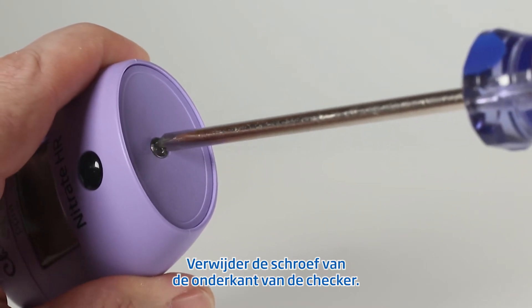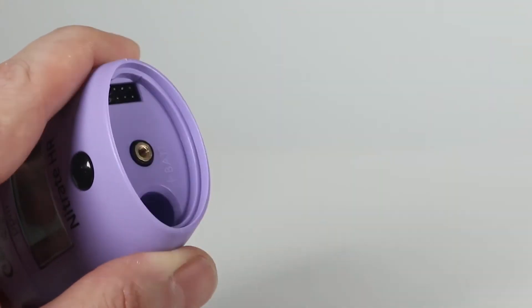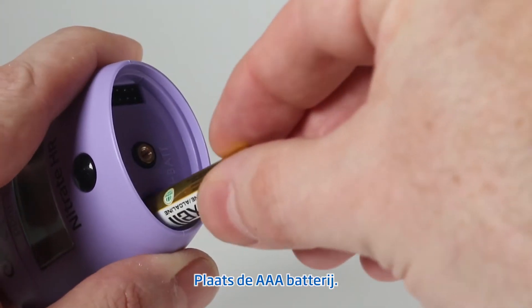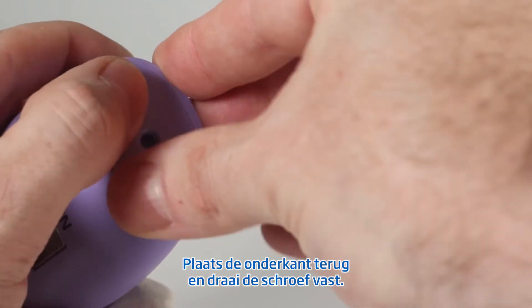Next, you're going to want to remove the screw from the bottom of the checker. Insert the AAA battery, then replace the bottom of the checker and fasten the screw.